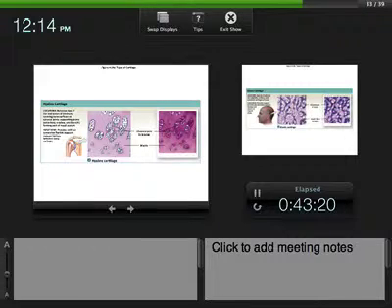All right, so now I'm moving on. I'm not being exhaustive. I'm not going to exhaustively ask you to identify all the types of epithelium and connective tissue. The ones that I'm picking and choosing will make more sense to you when you get to the lecture and I talk about all of them. But I'm just in lab. I'm just going to have you identify a few. Hyaline cartilage is important.